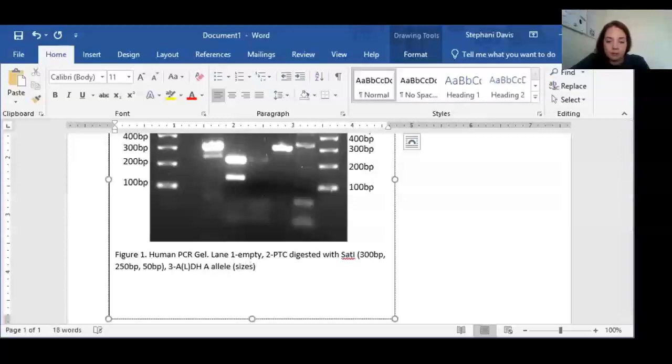Sizes. Put the sizes in parentheses. PTC uncut.